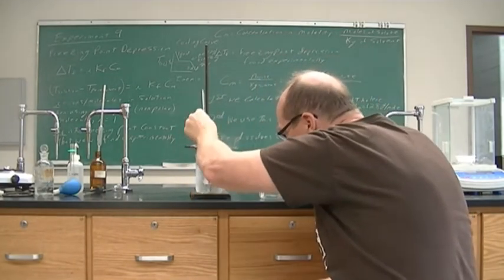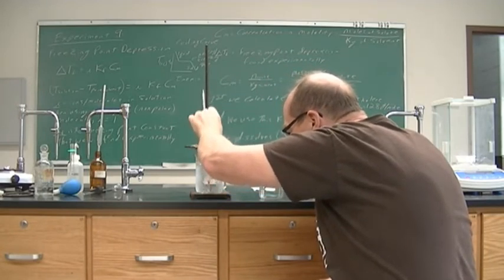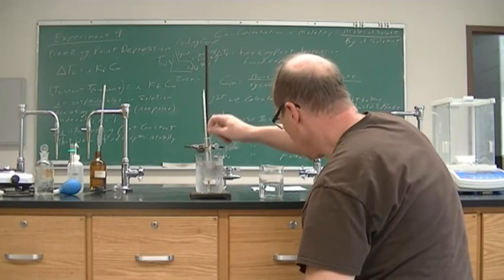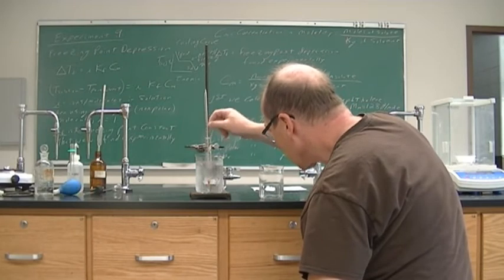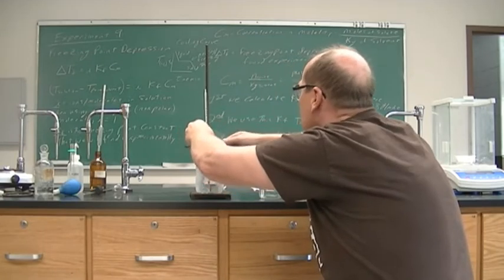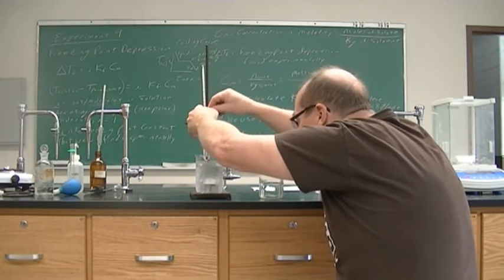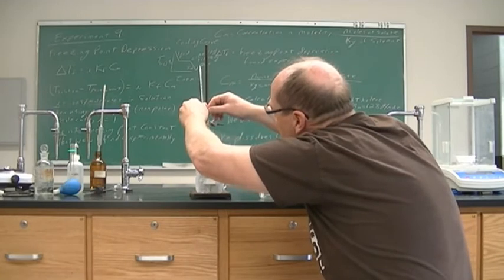Again, no solid. Let's see. Raise this around here, make sure I don't see any solid. I do not see any solid, and we are at right around 2.8.